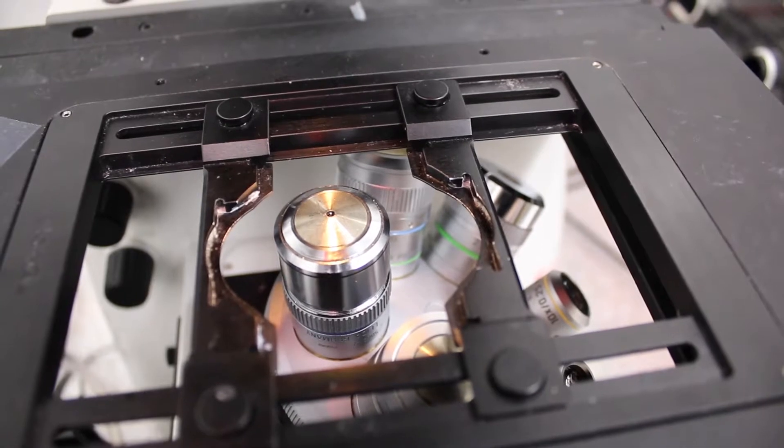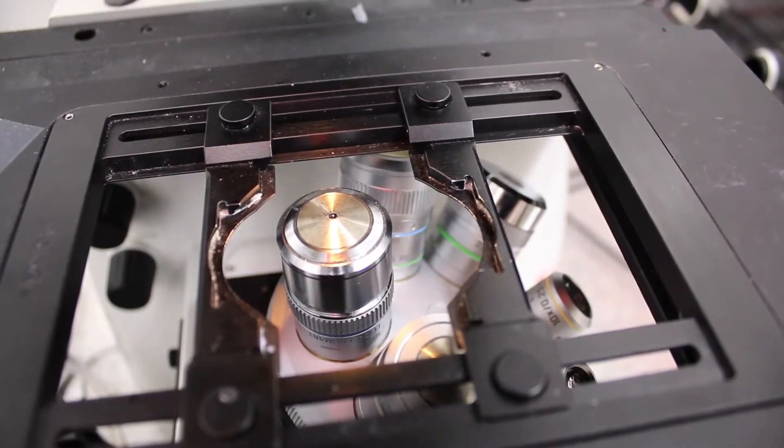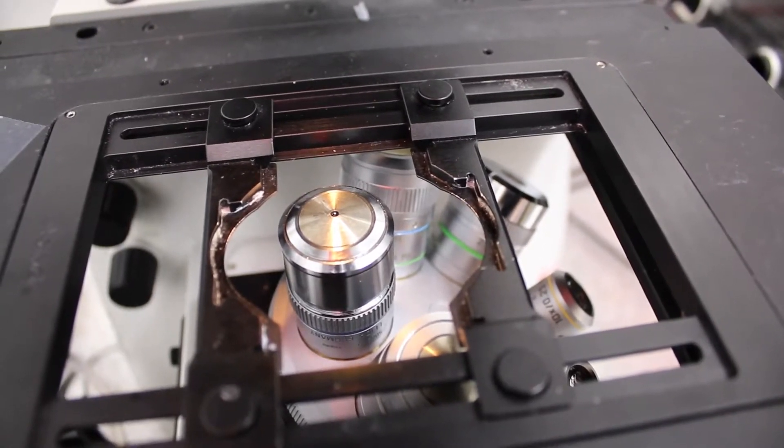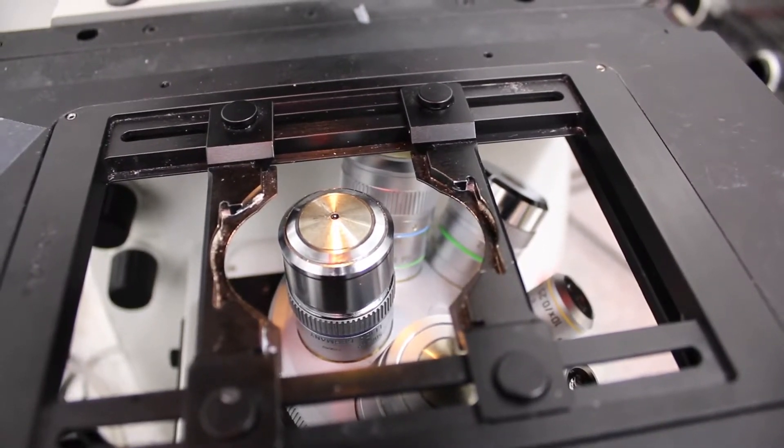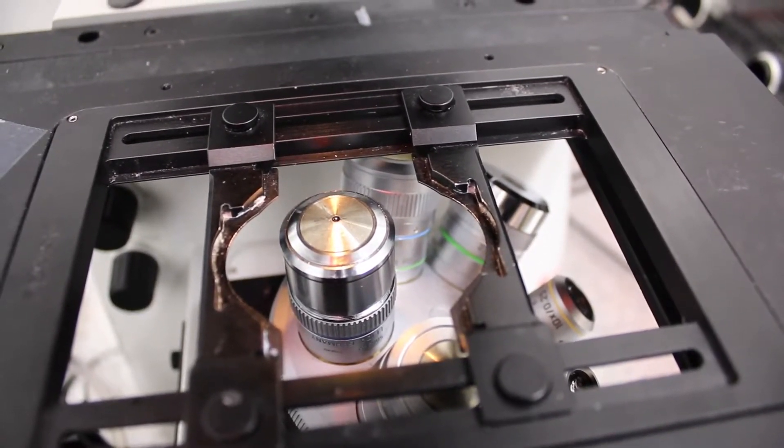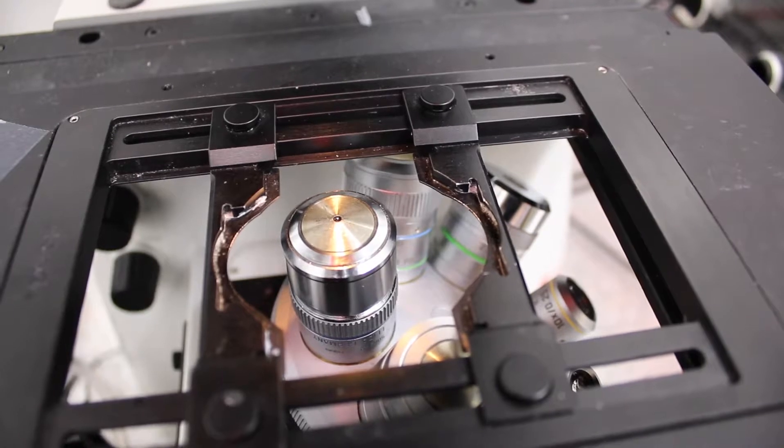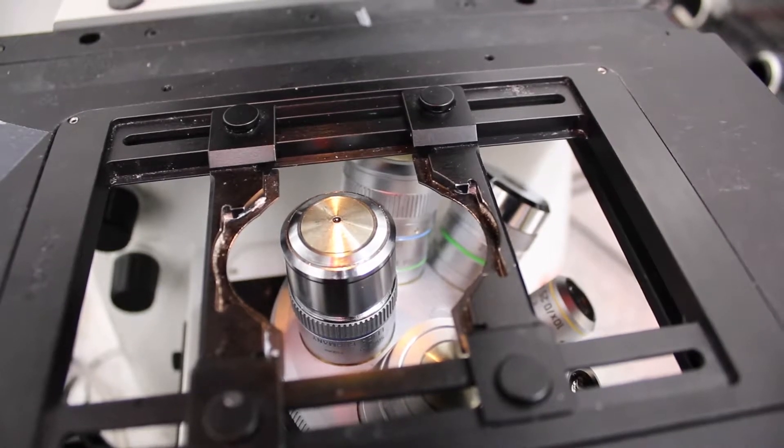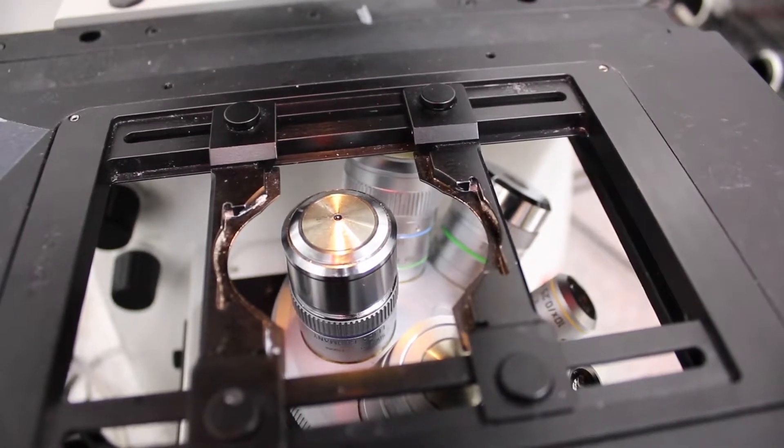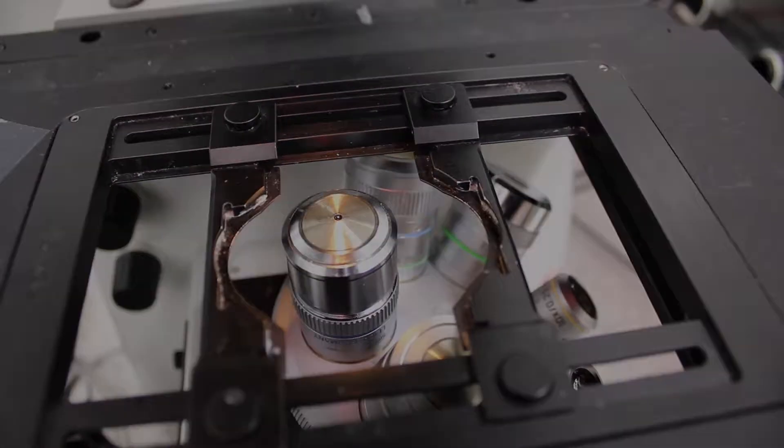They are also working with a very low working distance. So it means that you cannot observe through glass slides, but you need to observe through coverslip, that have a very small thickness.